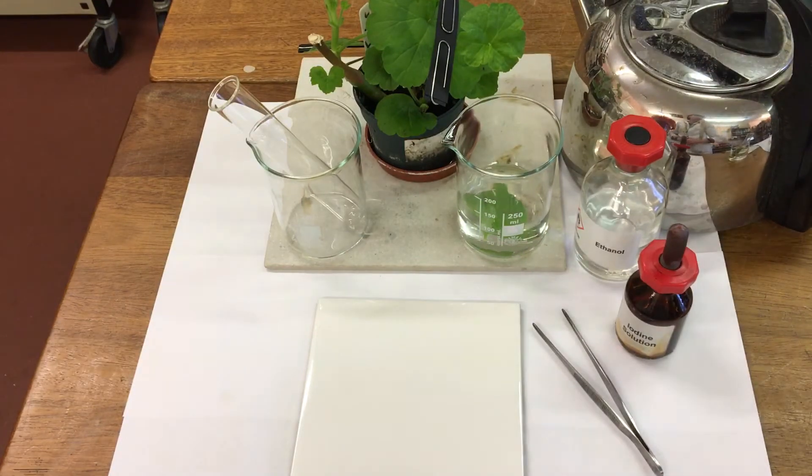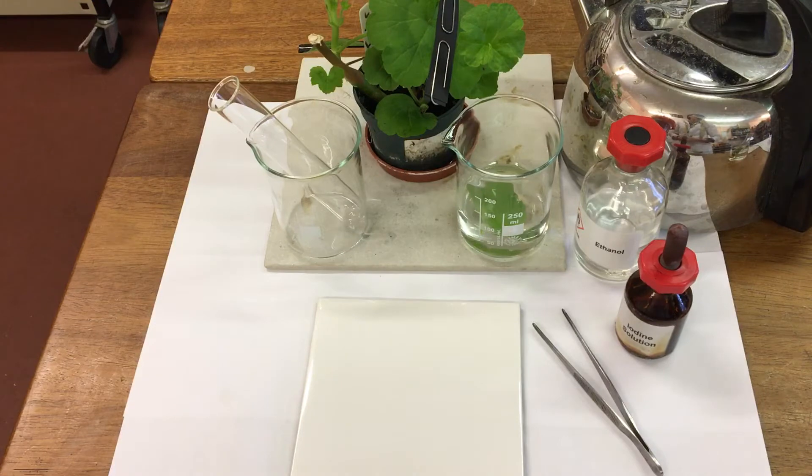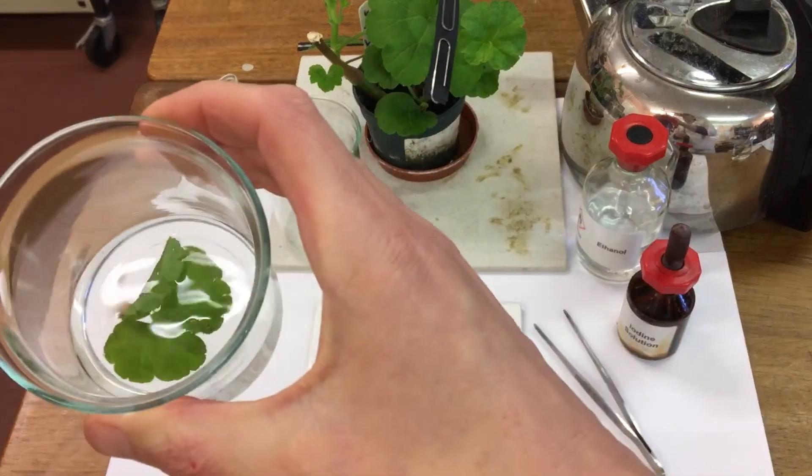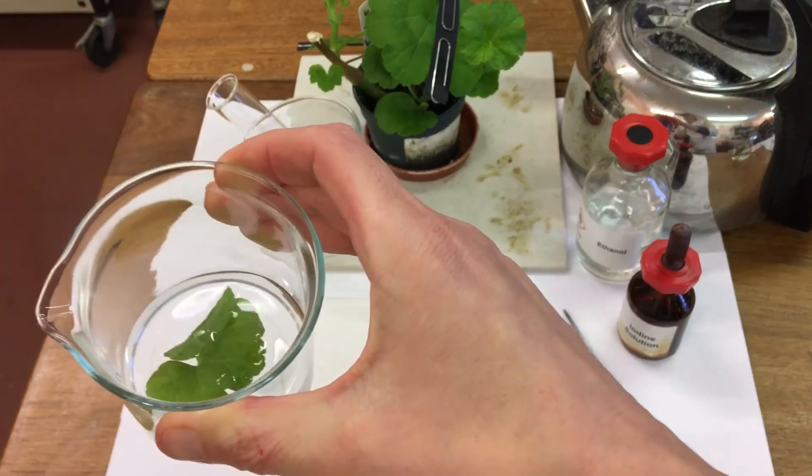So the boiling water kills the leaf, it destroys the cell membrane and it makes the cell all leaky. So we can see our leaf in there.